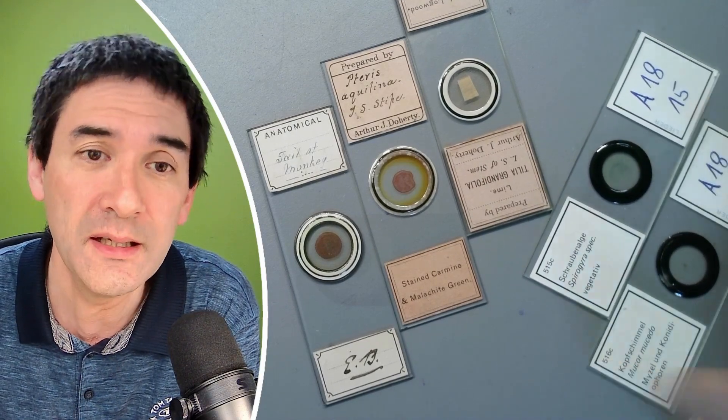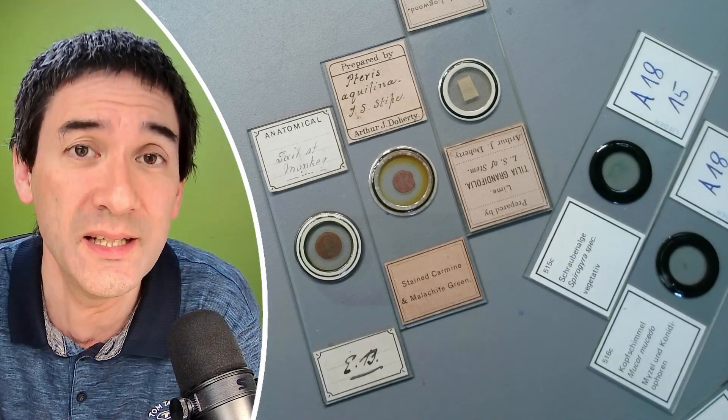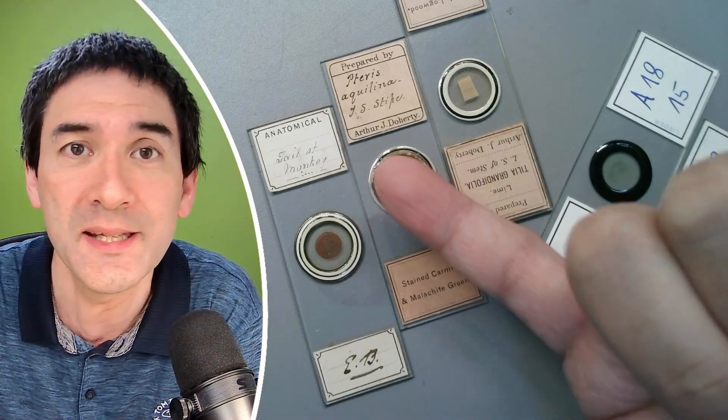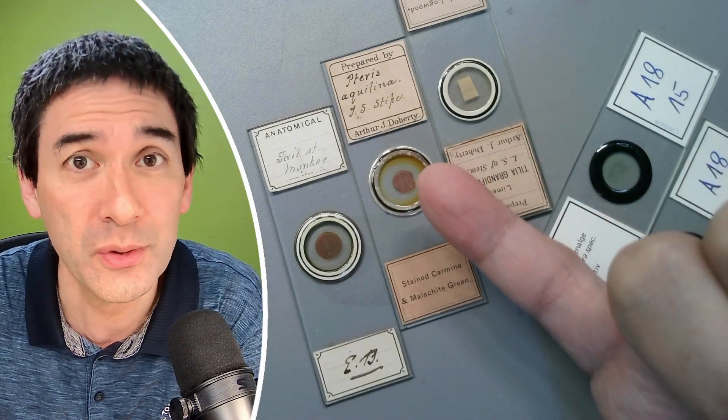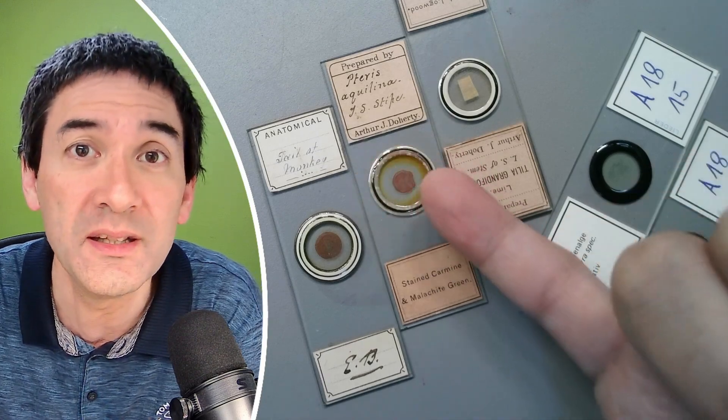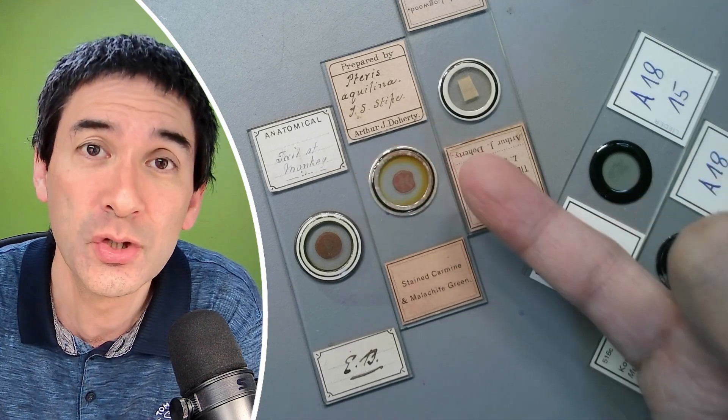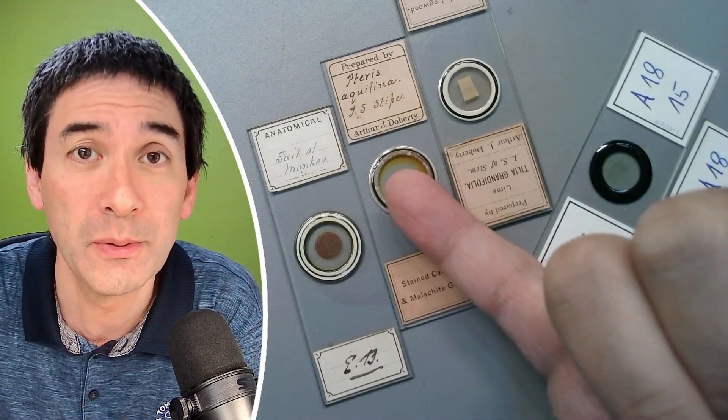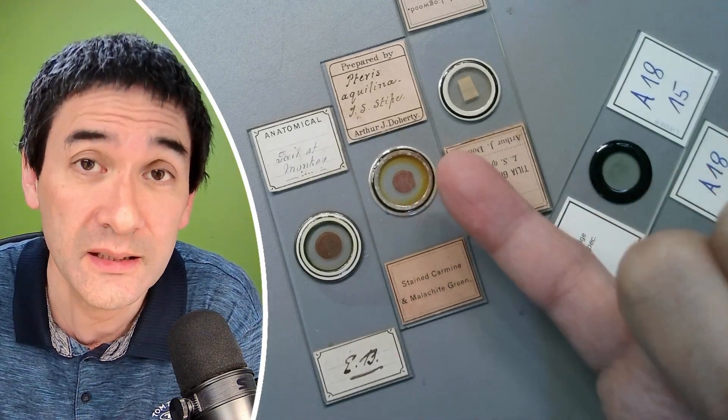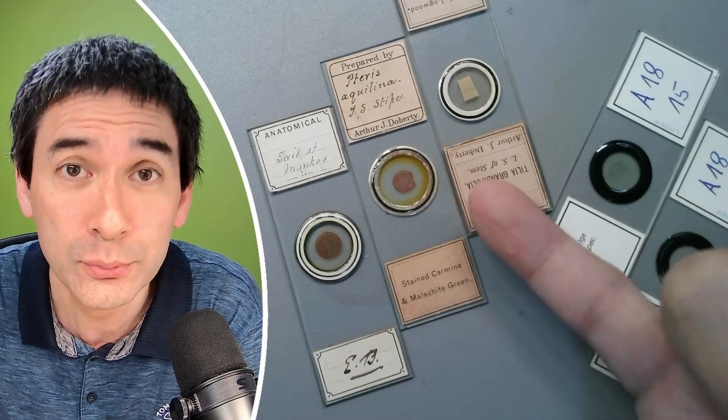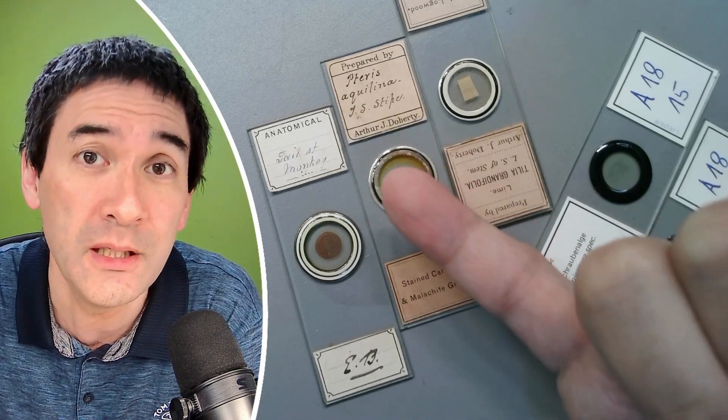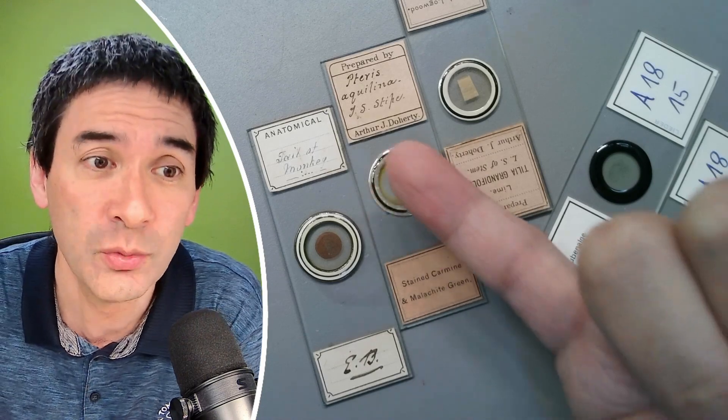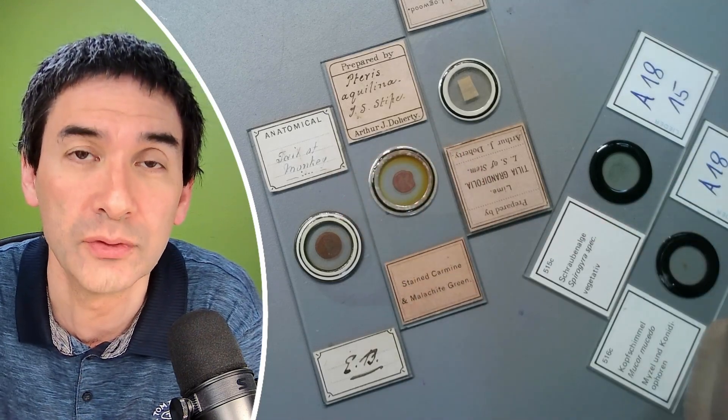What it does besides looking just nice is it prevents moisture from the air humidity from actually reaching the specimen. Not only that but also it prevents a complete drying out, a complete dehydration of the specimen. For example, when the slide is placed in a very dry environment, then it can be possible that some mounting media, which still retain a little bit of water, that the water evaporates. And then essentially the mounting medium starts to crack or it starts to shrink. And in order to prevent that, you want to put a ring around it.